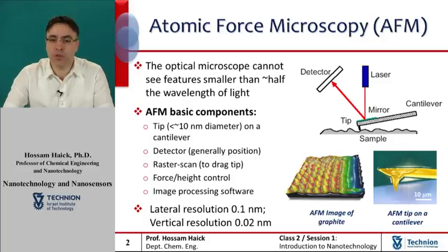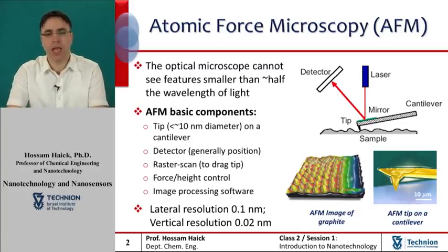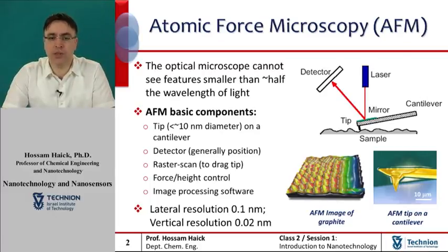When the tip is brought into proximity of a sample surface, forces between the tip and the sample lead to a deflection of the cantilever according to Hooke's law. Depending on the situation, forces that are measured in AFM include mechanical contact force, van der Waals forces, capillary forces, chemical bonding, electrostatic forces, magnetic forces, solvation forces, etc. Along with force, additional quantities may simultaneously be measured through the use of specialized types of probes.